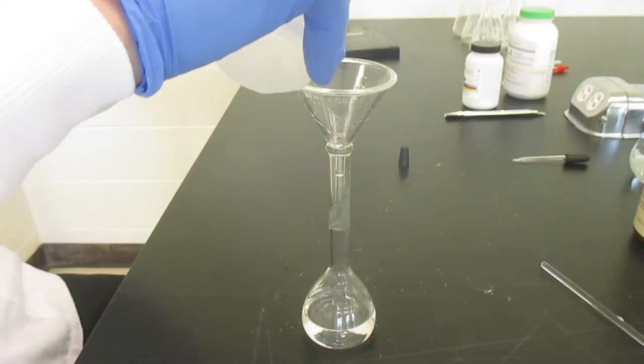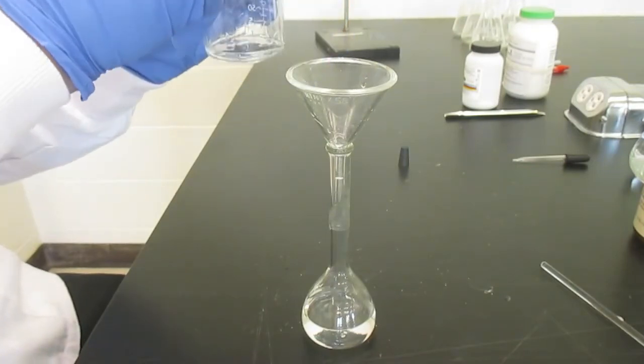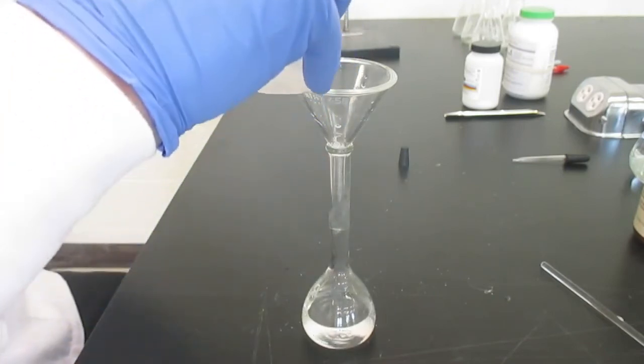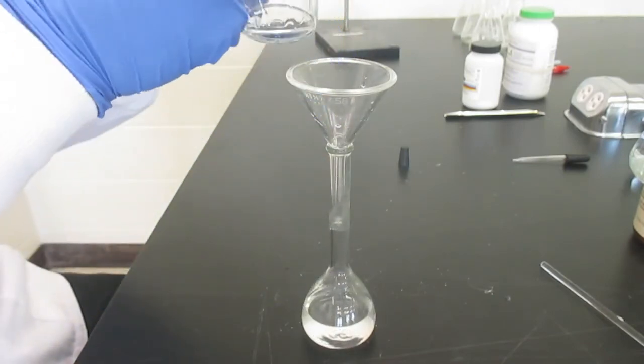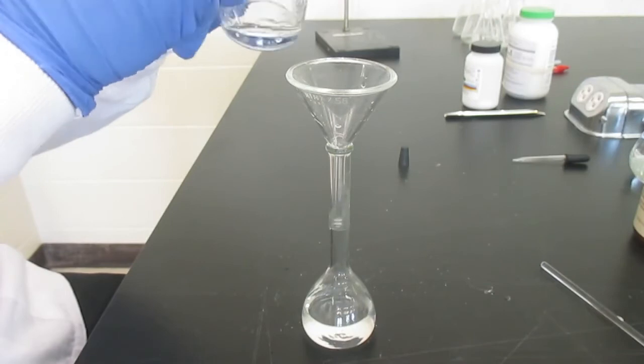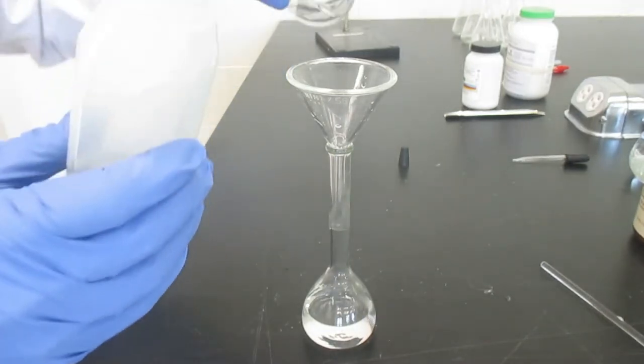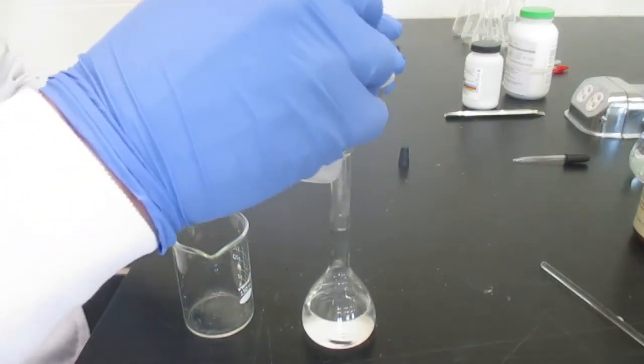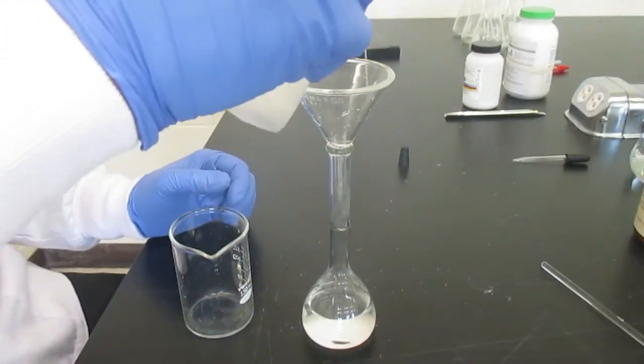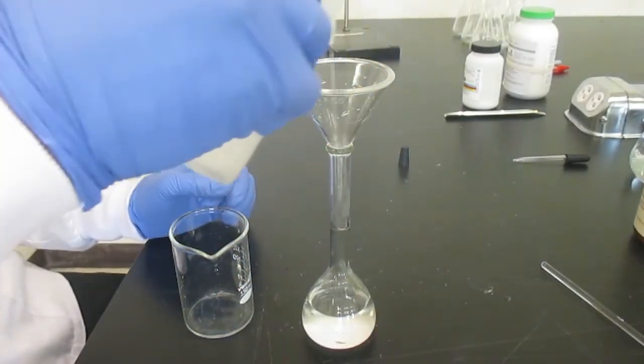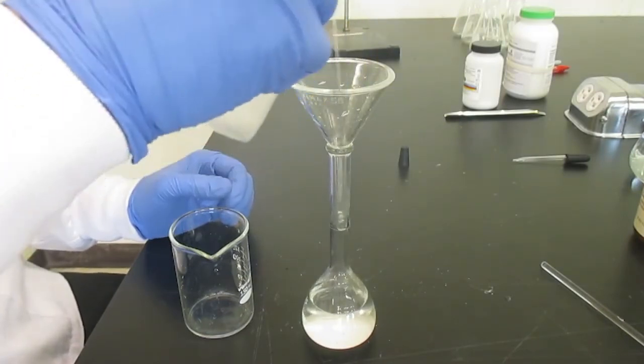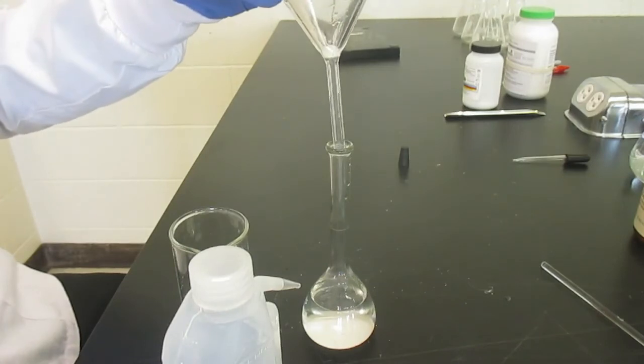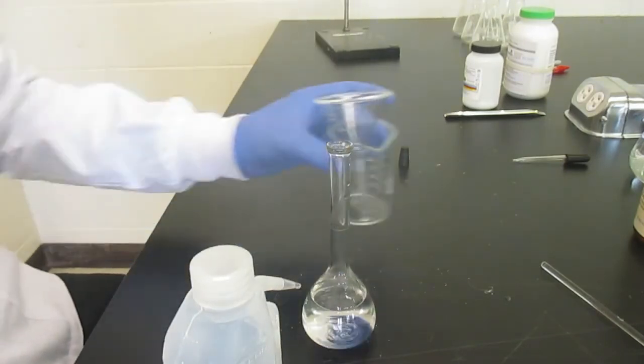So that means we rinsed the beaker. It means we rinsed the beaker again. Because we need every single molecule of KHP in here or we don't have 0.15 moles per liter. And if we don't have that, then our standardization is not going to do us much good. Alright, so everything rinsed out. And then we top it up to the line.